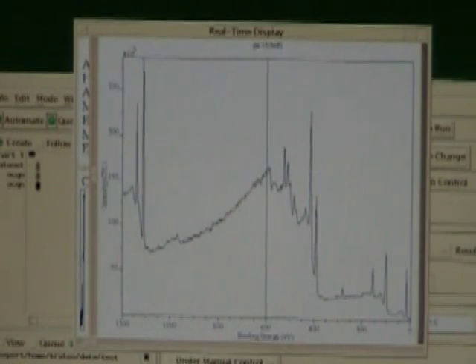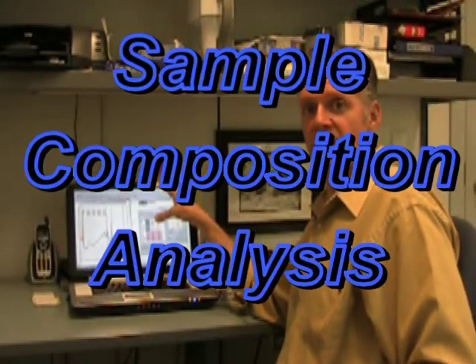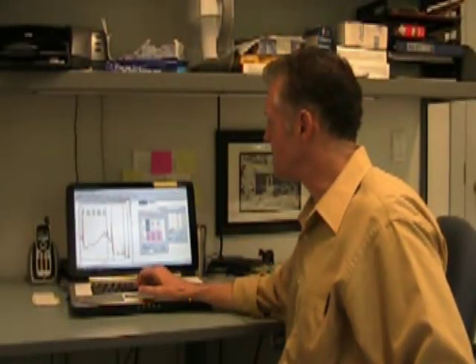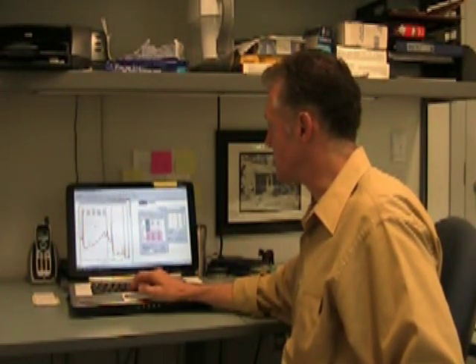We're going to do some high res there so we can pull those two apart and do a fitting routine on it to see how much of the nitrogen is actually bound to the gallium. Okay, so here we are now with the data on the data analysis program, and we're going to look at the information that we got from the spectrometer a little earlier.